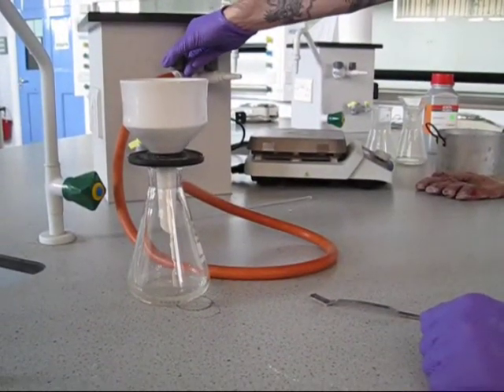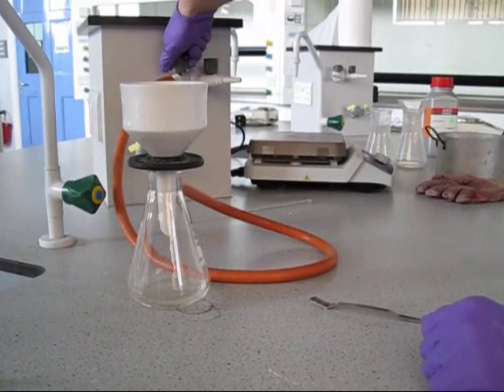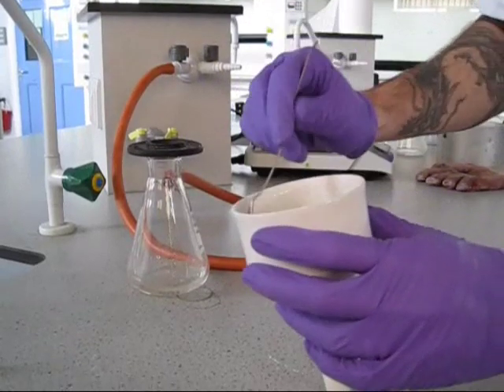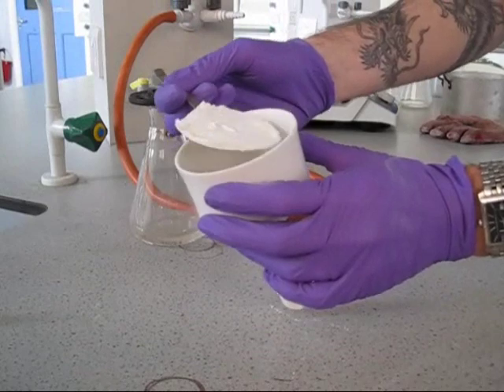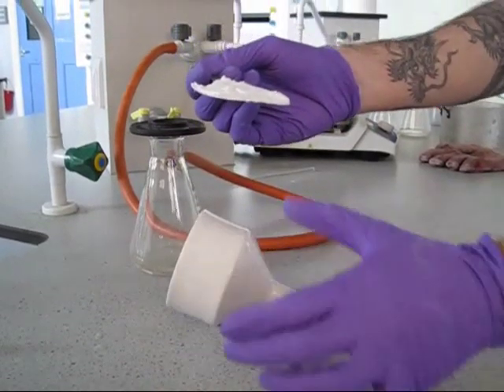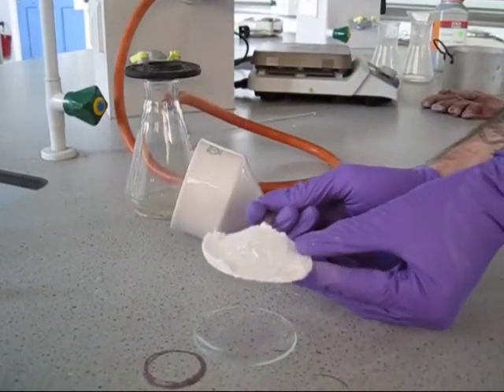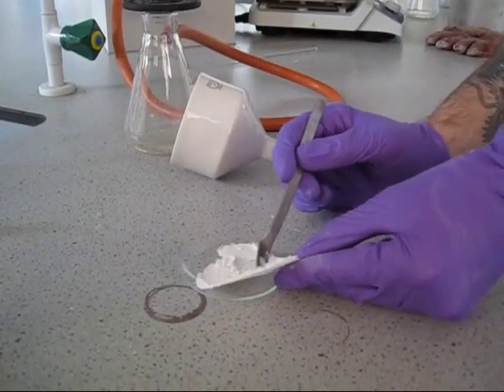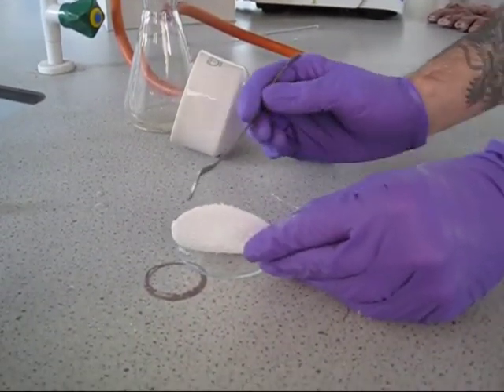Once the product has been filtered, turn off the vacuum, take off the funnel and remove the filter paper. Scrape the crystals from the filter paper onto a watch glass. Remember to put your name on the bottom of the watch glass so you can identify it later.